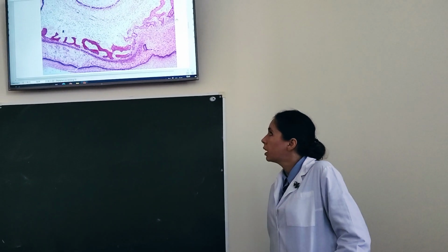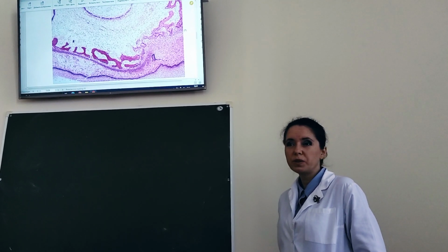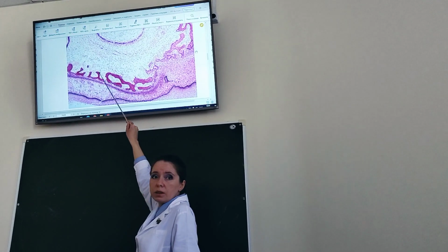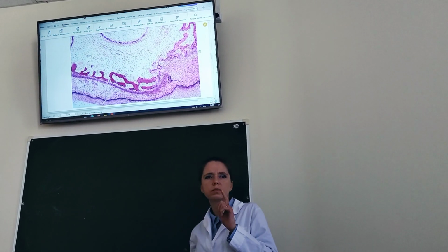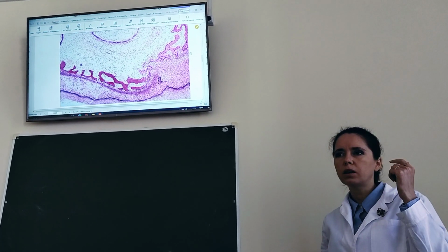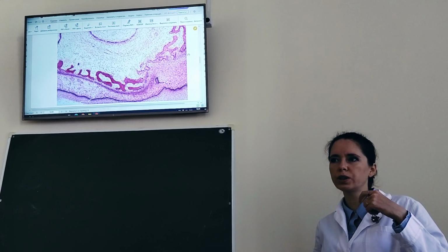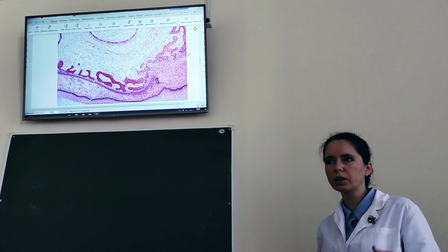I can identify this image as direct ossification because, first of all, I can see embryonic mesenchyme, mesenchyme-like tissue. Not to forget from where it is taken: on the example of the lower jaw, this is flat spongy bone, which develops by means of direct ossification.